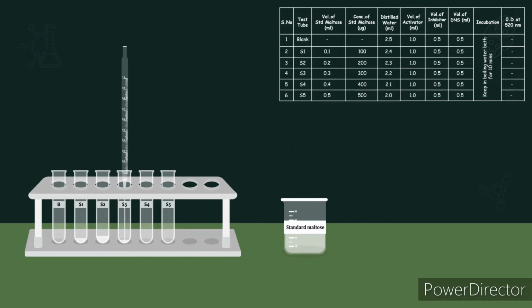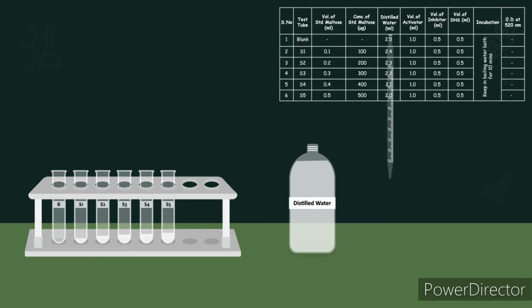The activator, inhibitor, and the reagent are all added, incubated, and measured at 520 nanometer.